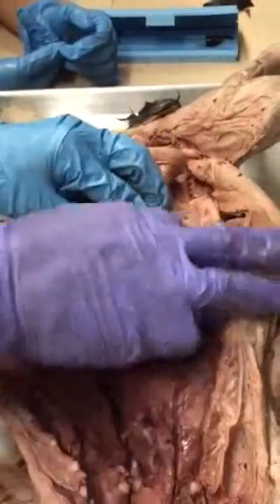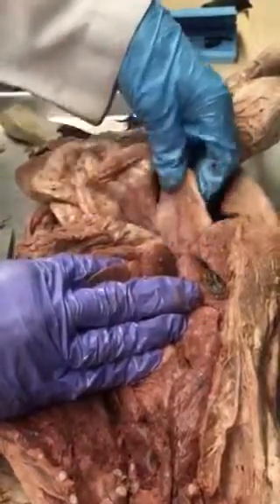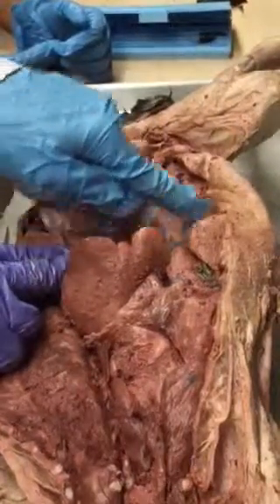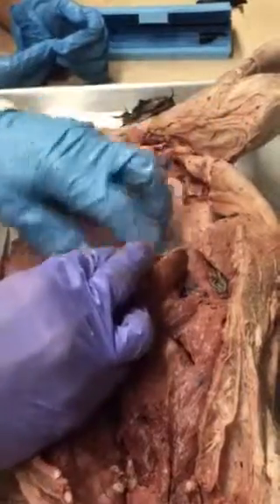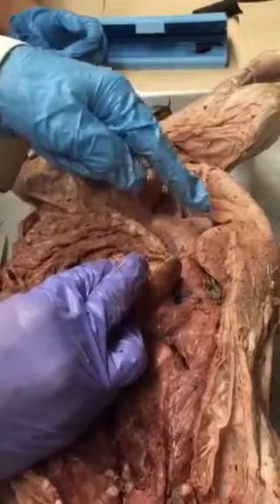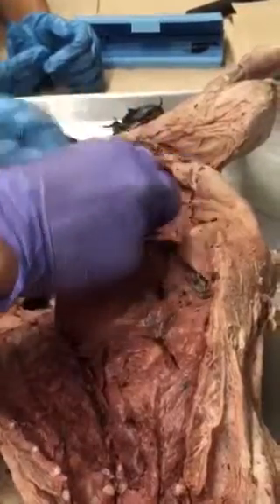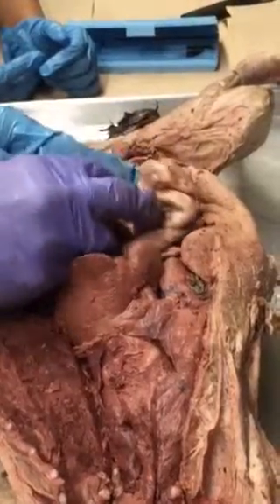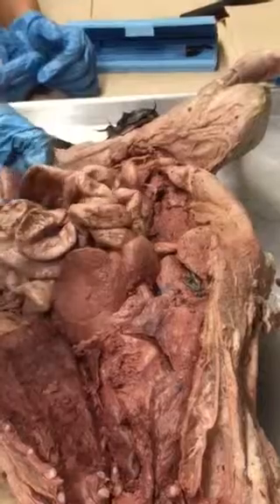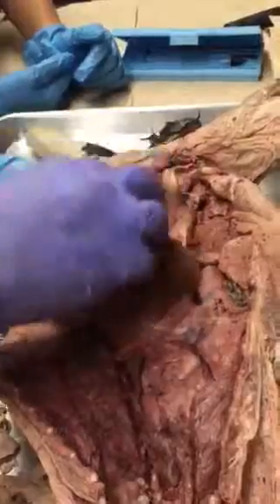The first segment initially coming off of the stomach is called the duodenum or duodenum, depending on who says it and the day. Okay, so duodenum is the first segment of the small intestine. So if I were to indicate this portion and you could see that it was close to the stomach, and I asked you for that specific segment, you'd say duodenum. As you continue along the small intestine, most of this in the middle is jejunum. I probably wouldn't ask that as a tag question, it'd probably be a word question. So the central segment of the small intestine is the, and then you say jejunum.